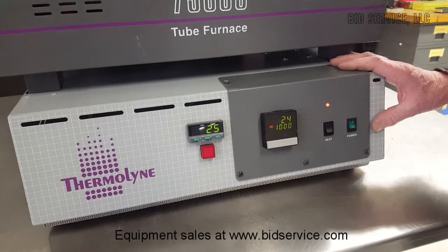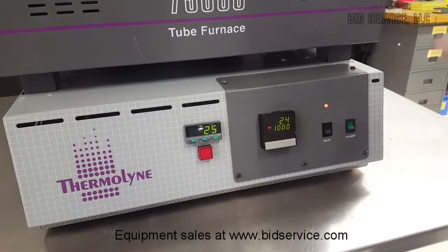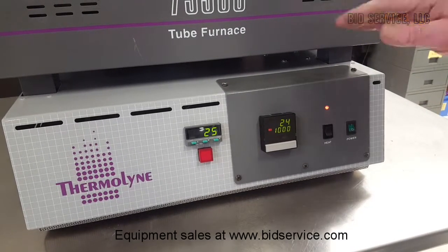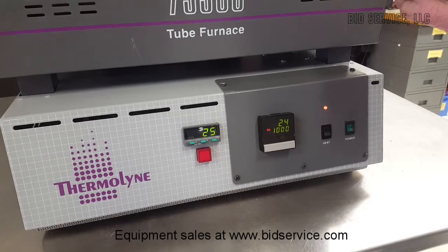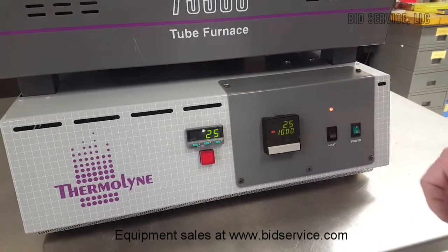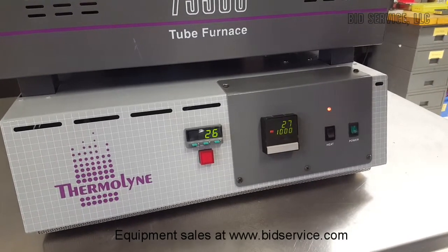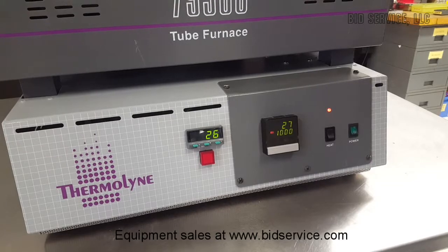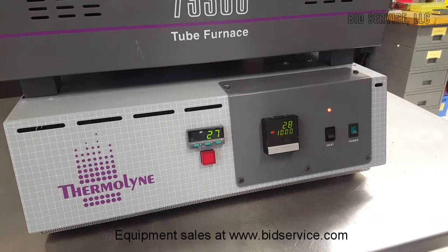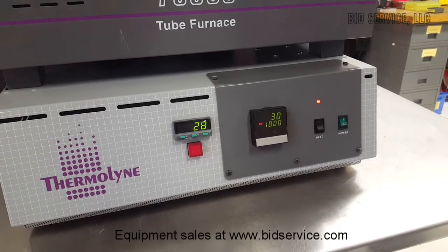Our particular customer wants to see this furnace come up to 1,000 degrees and hold for 30 minutes. Then after that, I will drop it all the way back down to room temperature and repeat that test again, bringing it up to 1,000 degrees and holding it for 30 minutes. This heats up pretty fast, but it needs a little time — as you can see, it's already starting to heat up. We'll come back in a little bit and see how it's doing.